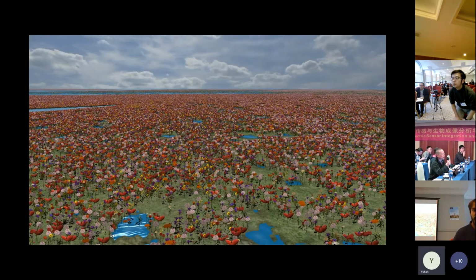It's a very nice talk, and it gives us a lot of insight into how we can deal with this data. But our question is, does this data mean anything? These red dots, is anything taken from a brain, or is it something you made up?